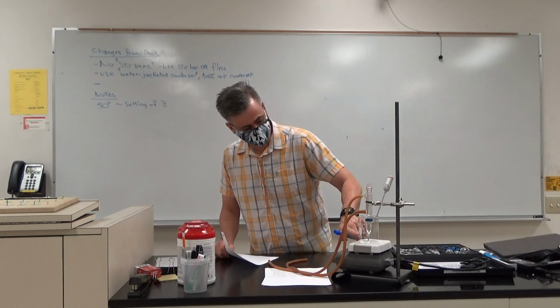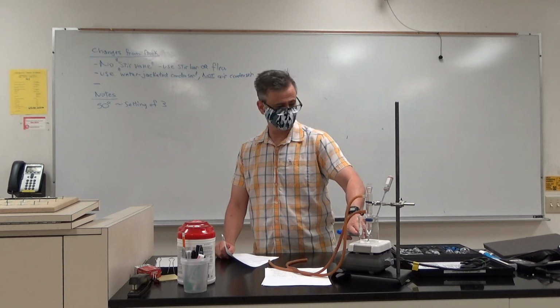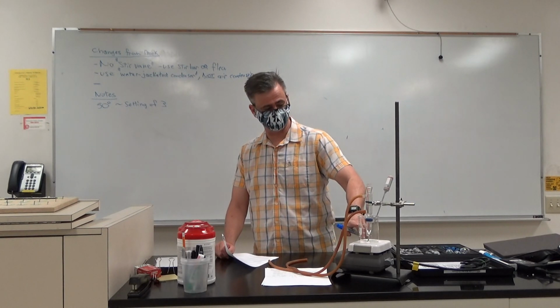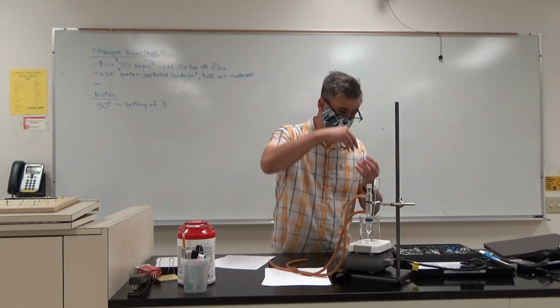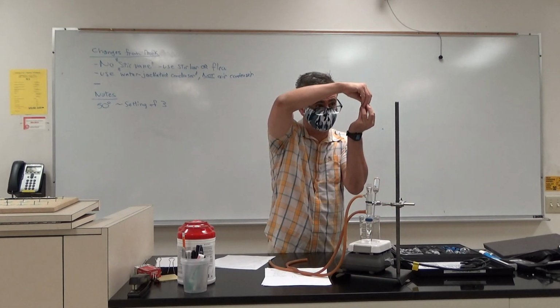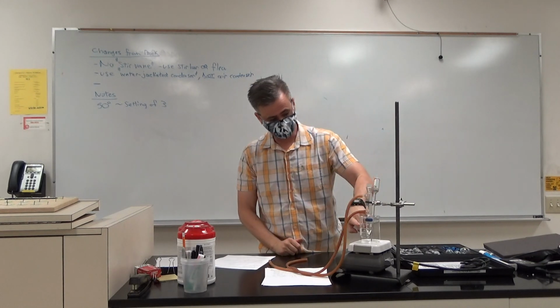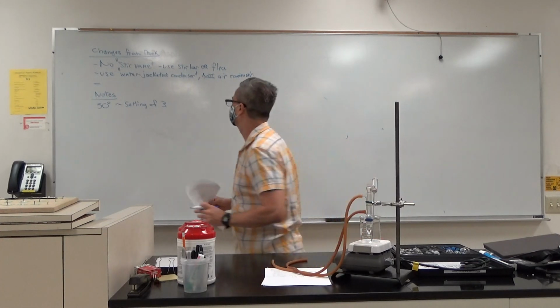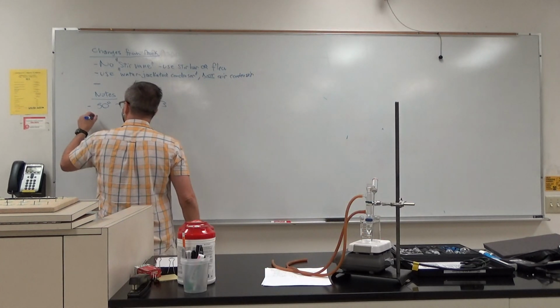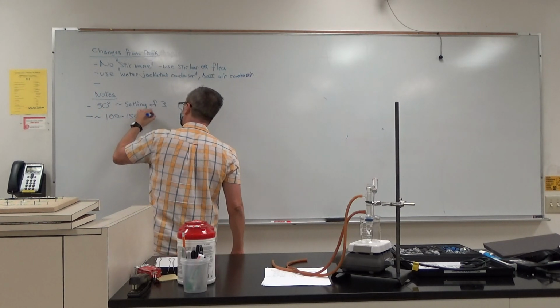You only need about 150 mLs of water in here. Okay, don't fill this all the way up for a number of different reasons. You don't want water over this seam where the condenser and the conical vial meet. You don't want water seeping in there and ruining the reaction. So you just need to heat the lower part of it. Okay, so around 100 to 150 mLs of water bath.